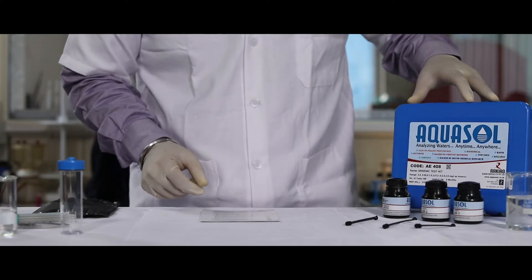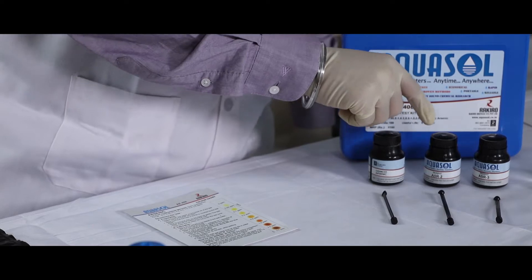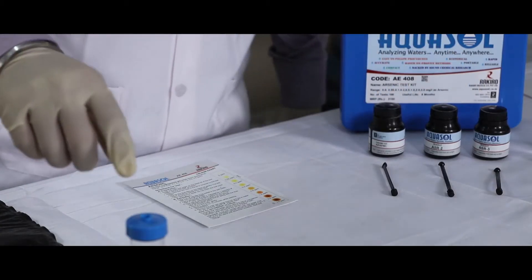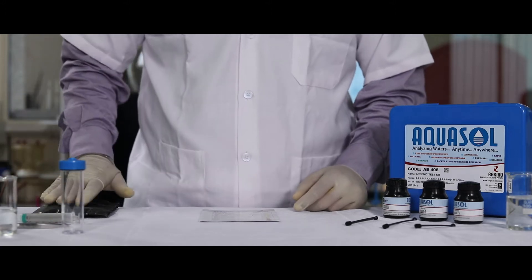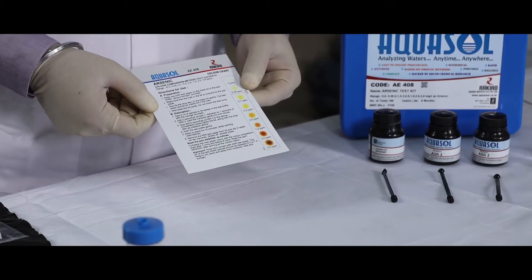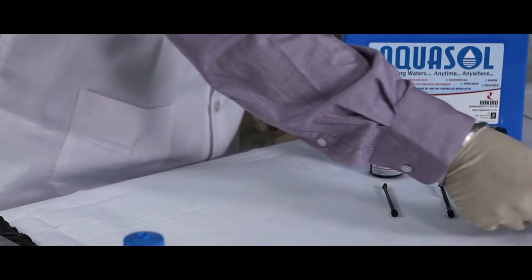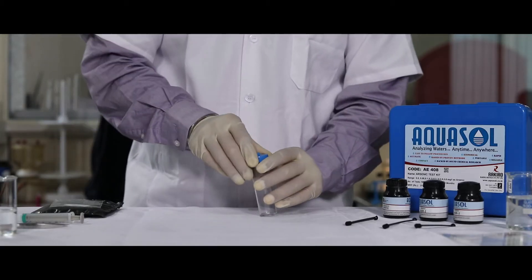This is an arsenic test kit consisting of ASR 1, 2, 3 along with the test bottle, a syringe, test paper, and a procedure card. Please read the procedure card to follow the instructions. To begin the test, remove the blue cap.